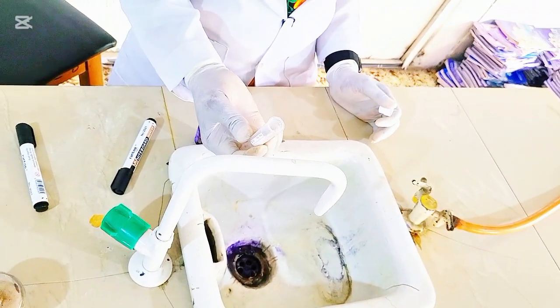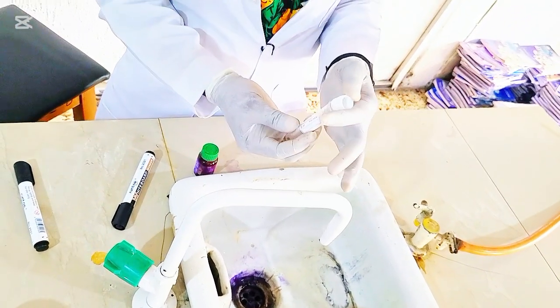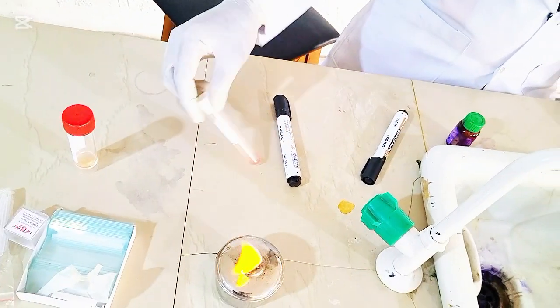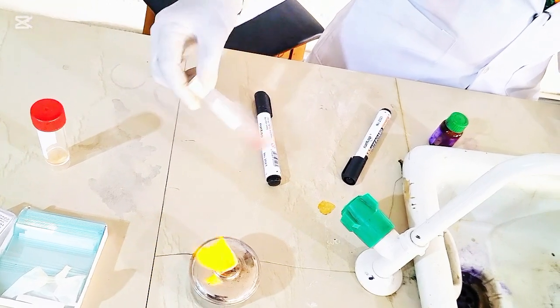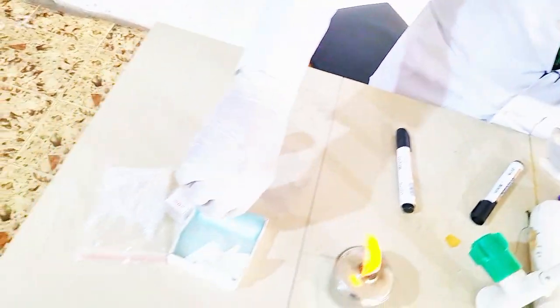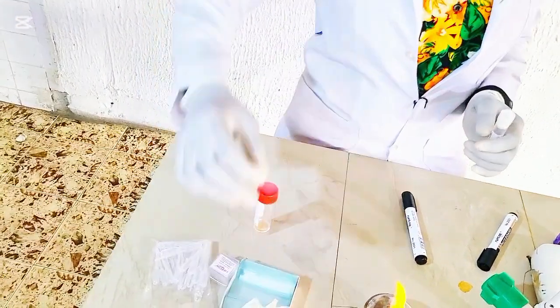This is it. So that's how you decant. You decant by quick inversion. Then you tap. You tap the sediment. And then you get your clean grease-free slide.